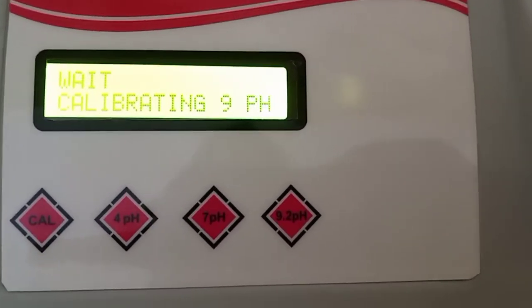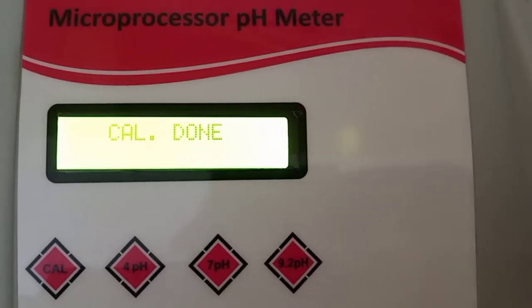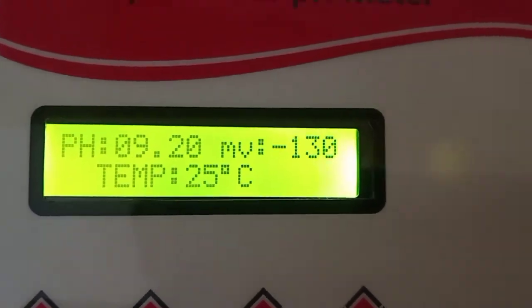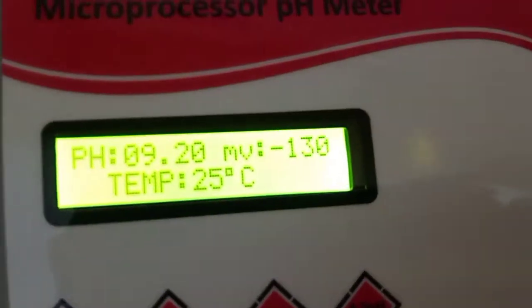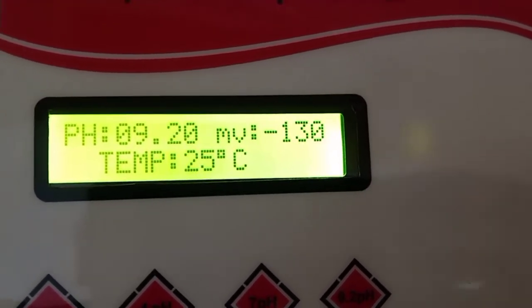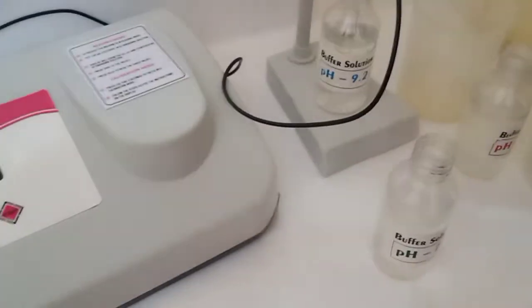Once the calibration process is over, the machine automatically comes into measurement mode. The 9.2 pH buffer shows a millivolt reading of minus 130 and temperature is 25 degrees. Now we will change the solution.